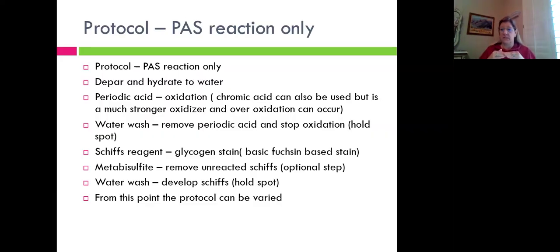Now, this is a great holding spot, because the longer you hold there, the brighter that pink is going to get. Now, there's sort of a trick of the trade here. Whatever time it is that you went into your Schiff's reagent is the same amount of time that you should stay in that water wash. And the equal amount of time assures you that you have brightened that Schiff's up to the amount of dye that you've given it. It's that dye concept. So however long you're in Schiff's, same time in the water wash.